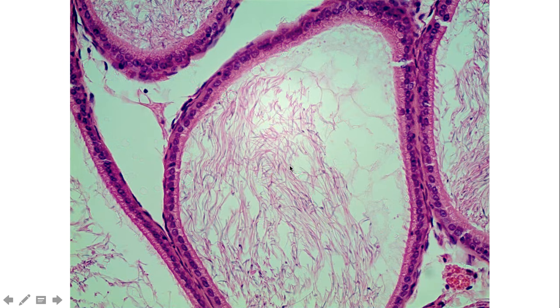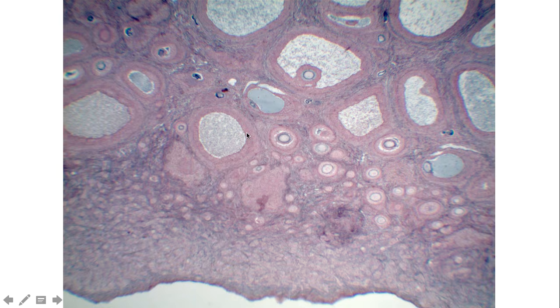Both of them should have spermatozoa or developing sperm within the lumen, but here the wall is going to appear pseudostratified, as opposed to a layer composed of many cells of developing spermatocytes. The female reproductive system has only two slides, although they tend to be a little more complex.